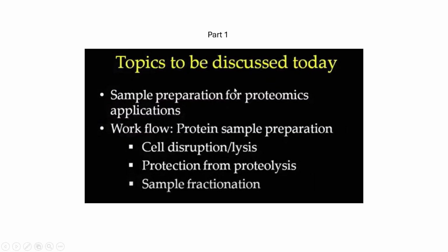So first, in the first lectures I discussed that generally a protein will be produced inside a cell, right? And we need to lyse the cell and take the protein outside first. So the first thing would obviously be lysing the cell. Generally inside the cell, protein is protected. Like there are protease inhibitors present, etc. But as soon as it comes out, it might be unstable, and we need to make sure that whatever proteases generally degrade the protein are inhibited by adding certain protease inhibitors, so that the protein which is coming out does not get degraded.